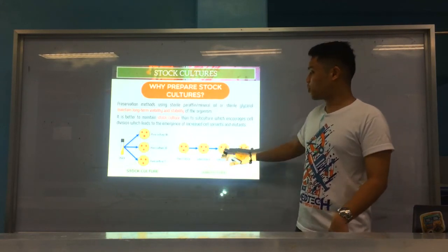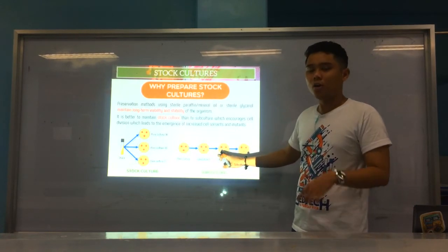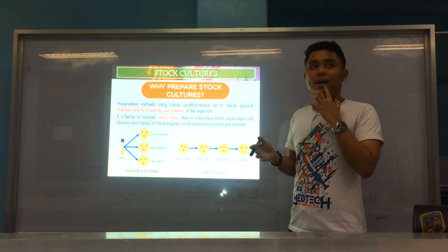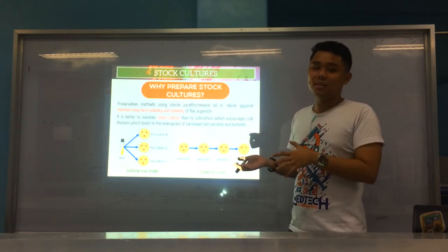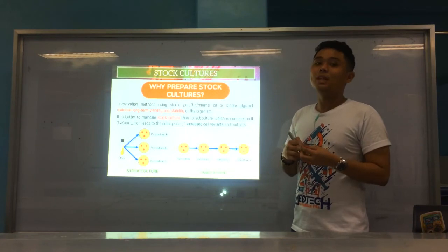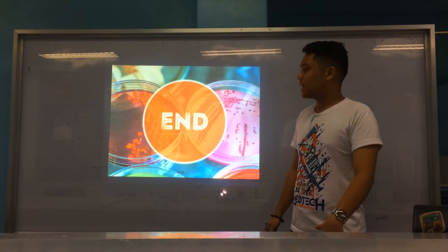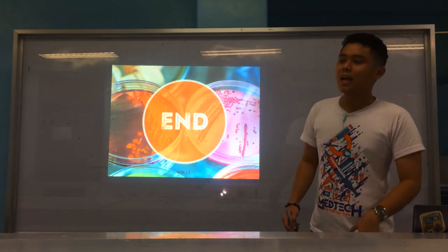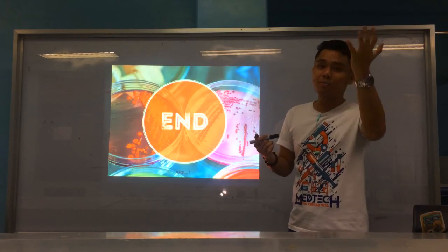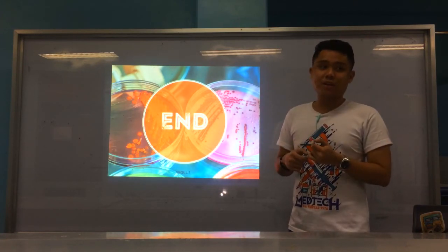Okay? So, if mag-subculture ka, it's only advisable na until the second subculture. Okay? Because after that, magsige na sila mag-change, mag-start na sila mutate and produce mga cell variants and mutants. Okay? Alright, so basically that's it for pure culture techniques. It's quite short lang. But again, pure culture techniques are one of, or if not the most basic and most fundamental skills na dapat mag-learn sa usa ka bacteriology student.